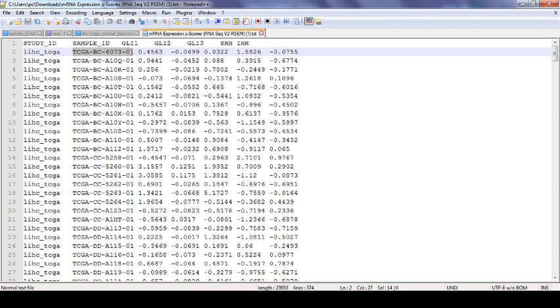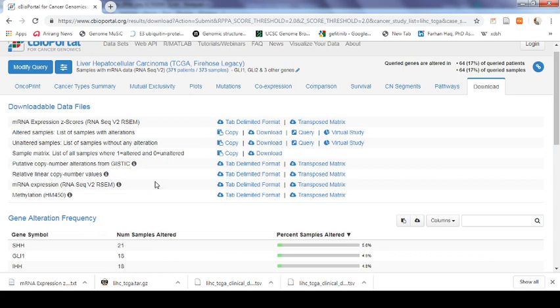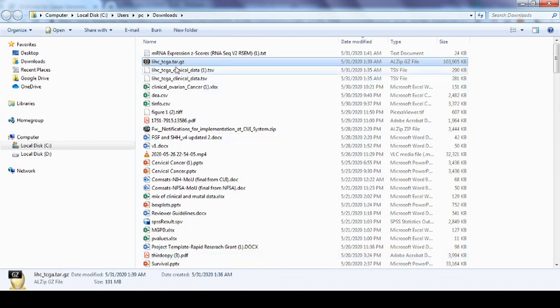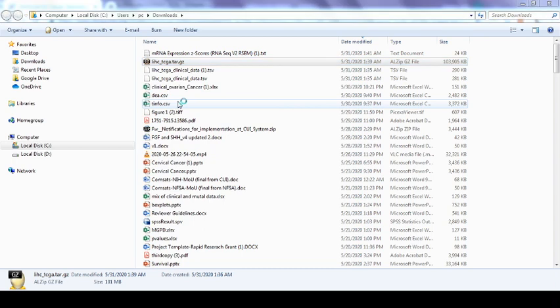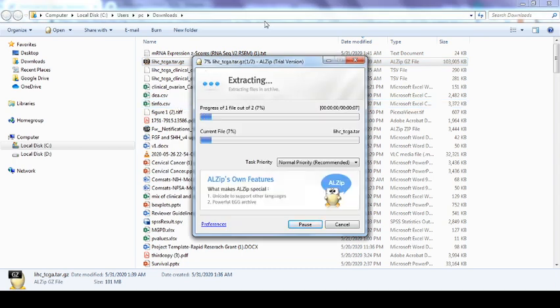Okay, so I think this is very easy to follow, to download the information. Now here you can see that this one is also downloaded. Let's see if we want to look for all the expression data, for instance, you know that there are almost 22,000 protein coding genes, right?